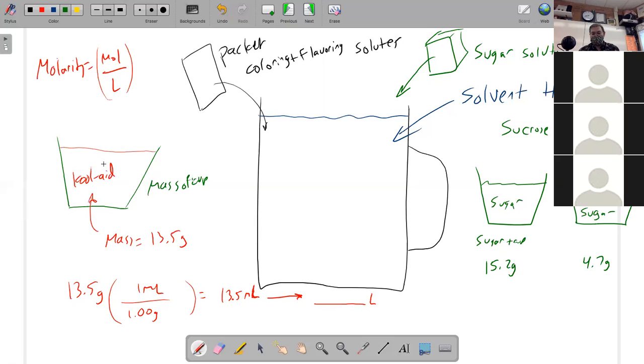So this is an unusual technique, but generally the plan is we oftentimes do this process of weighing by difference. You find a mass of something before, you find a mass of something after, the difference must be how much you used. Similarly, when you weigh the cup and you weigh the cup with the Kool-Aid, the difference between the cup with the Kool-Aid and the cup by itself must be the mass of just the Kool-Aid.